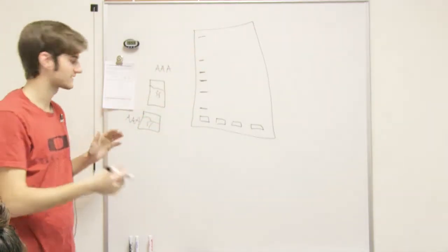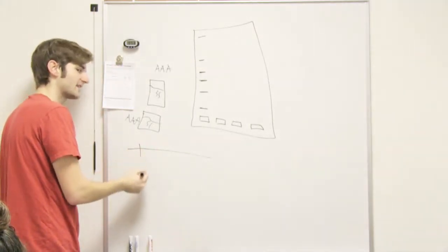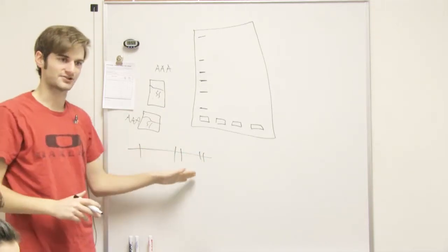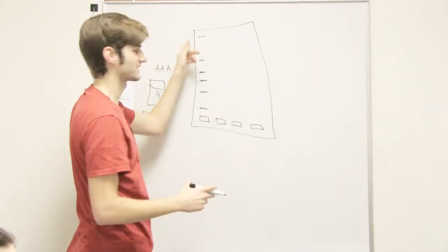The longer pieces. So let's say, here's my strand of DNA. Oh, there's an AAA right there. Oh, there's another one. Oh, there's another one. It cuts like that. So there's different lengths of strands. The longer ones can't go as far, the shorter ones can.